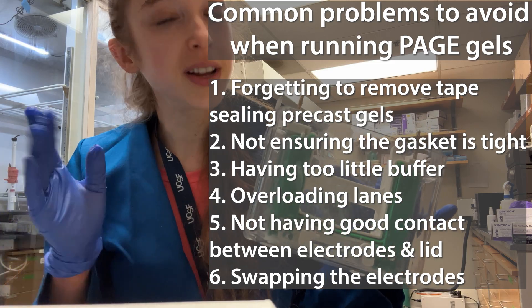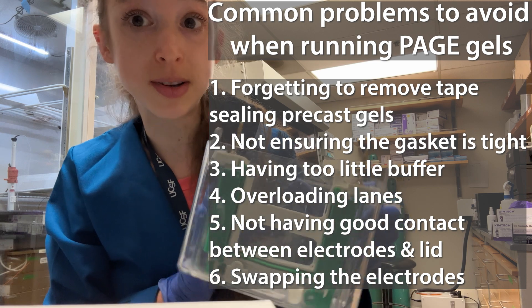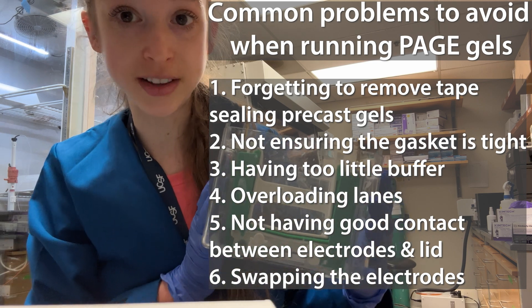If you work in a biochemistry lab for years, when it comes to gel electrophoresis, you see a lot. So here's how to avoid some of the most common problems when running a PAGE gel.